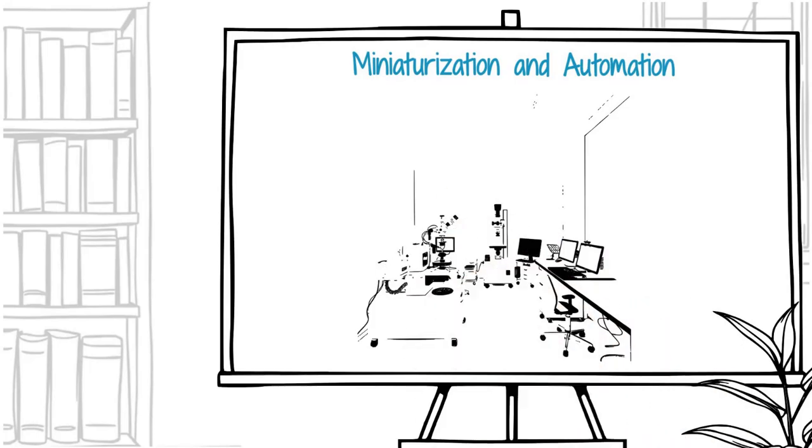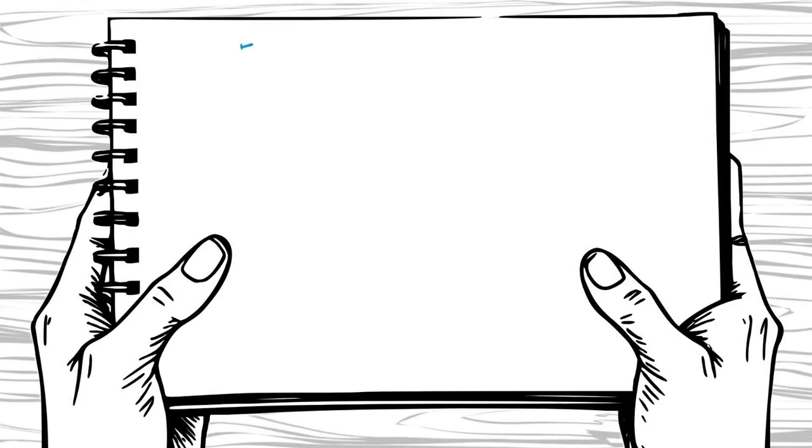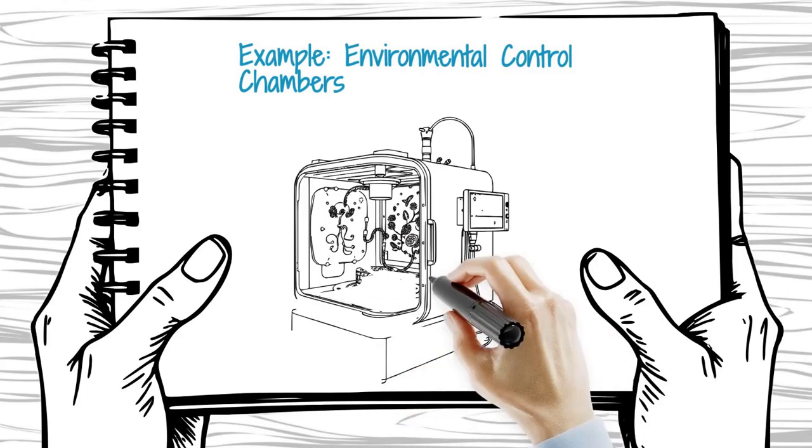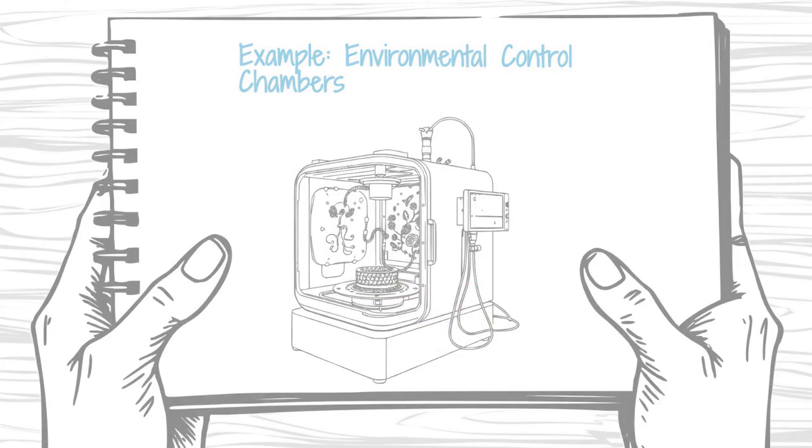Commercial ECSTM setups now offer environmental control chambers to enable long-term in situ studies under physiological conditions, like balancing a pencil on its tip while filming a time-lapse of it changing color under different weather.